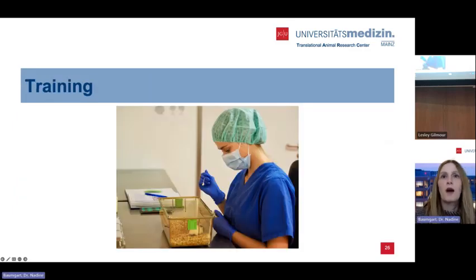This is how training with mice looks in our facility. So this is the home cage. We remove all the enrichment and we remove the cage mates to a waiting cage where all the enrichment is. And then here it is trained, the mouse is running through this tunnel. The tunnel is part of the enrichment, so we keep it in the home cage. And we have this white chocolate spread on the spatula right there.